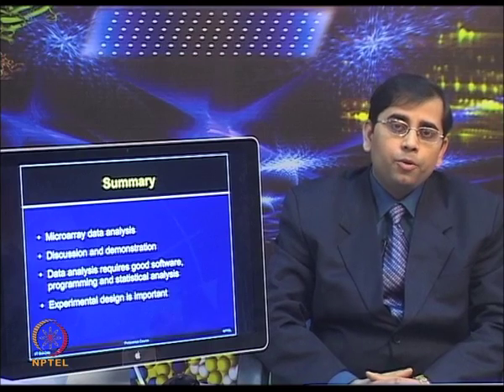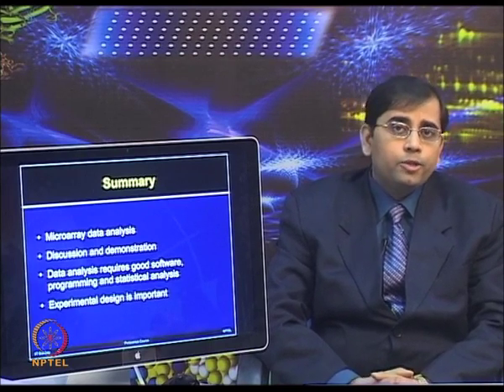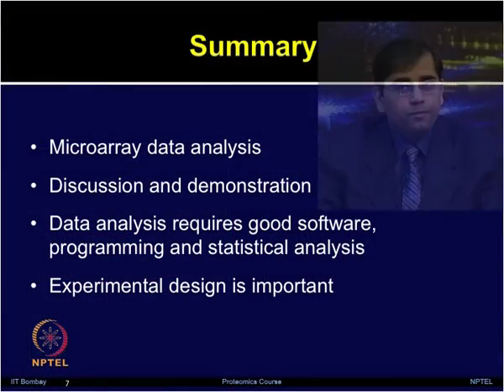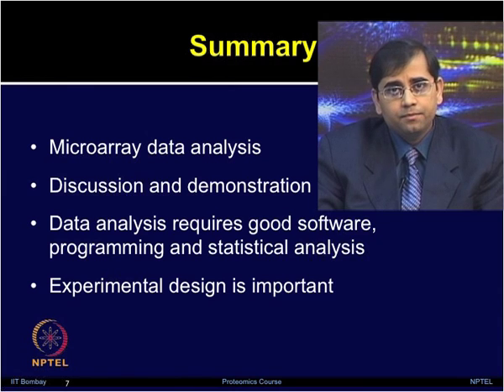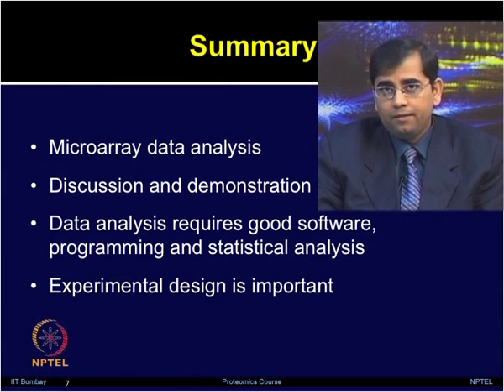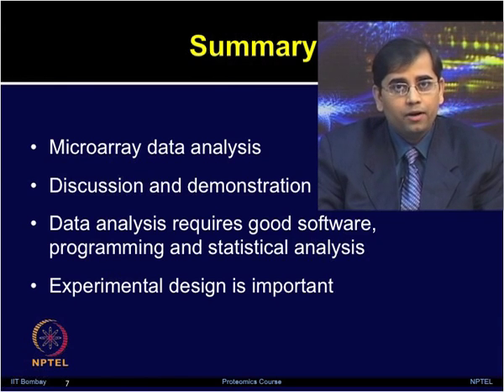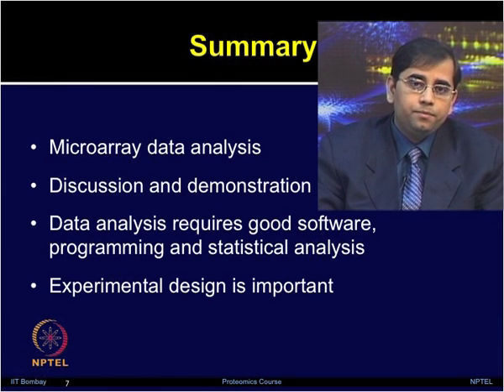Pleasure. So today we had a discussion about microarray data analysis. You also saw a demonstration of the software to learn about various types of parameters involved in performing this microarray data analysis. You must have got a glimpse of how complex this process is, and one really needs to put in several hours of hard work to obtain any meaningful biological information.